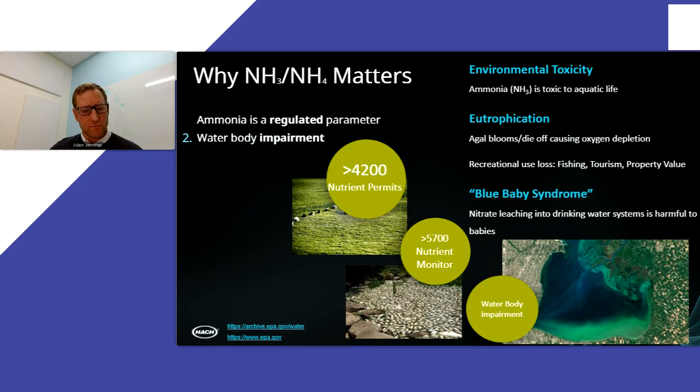So when we're talking about monitoring NH3 and NH4 for these situations where we have possible water body impairment, we have NPDES permits that are being distributed throughout our country at wastewater treatment plants, and it's a regulated parameter. So we have lots of treatment plants that have NPDES permit regulations for ammonia or another form of nitrogen that may include ammonia.